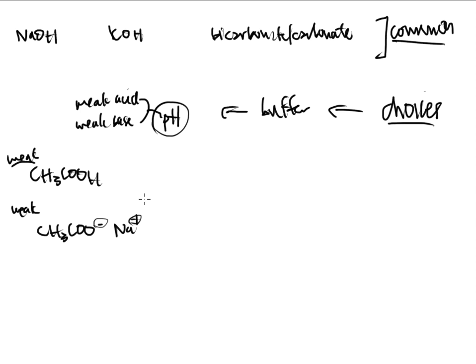So sometimes I'm going to be reading a method or an SOP, and it's going to say prepare a buffer that consists of the following. And it gives me numbers to weigh out, and I'll measure those amounts out in grams or milligrams. It tells me what to dilute it up to, and this is going to be a proper buffer that will control a pH environment. Well, the acetic acid and acetate is just one of those examples. And there are tons of examples of buffers out there.